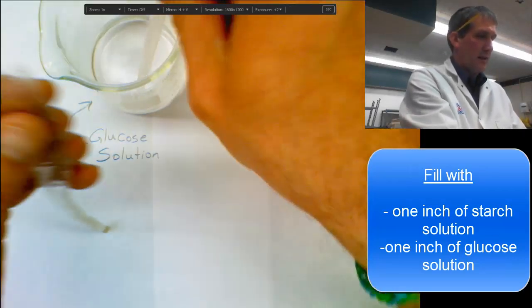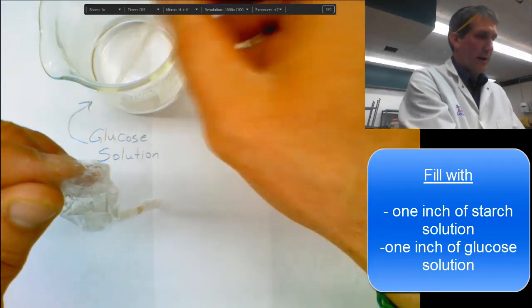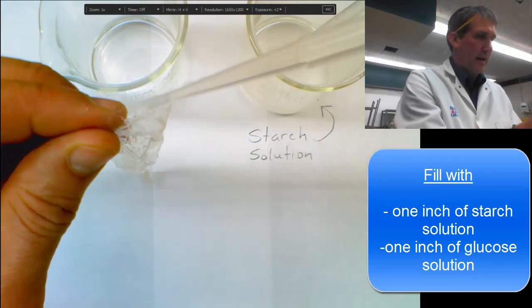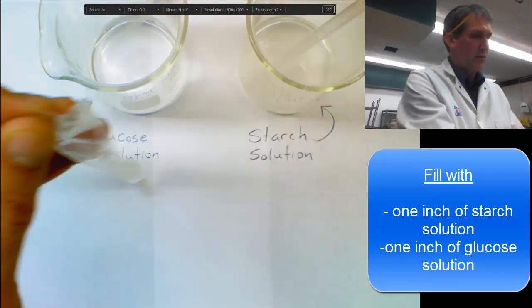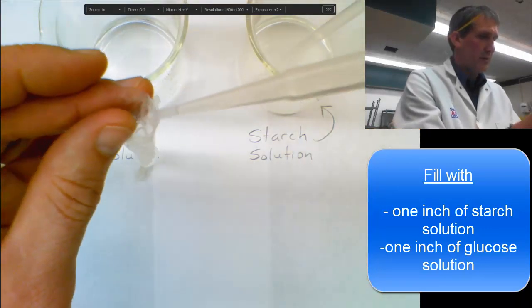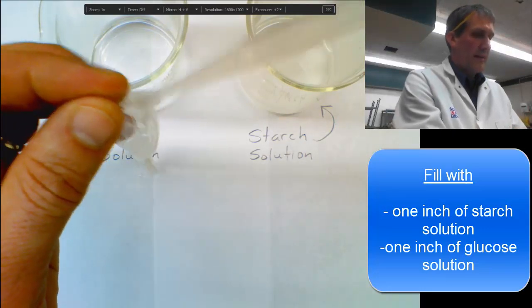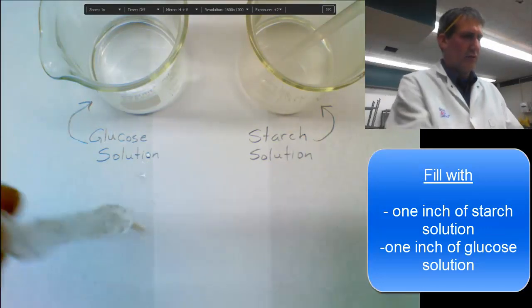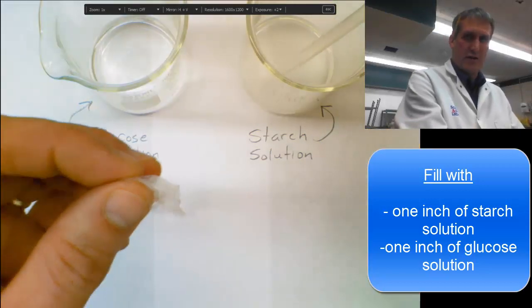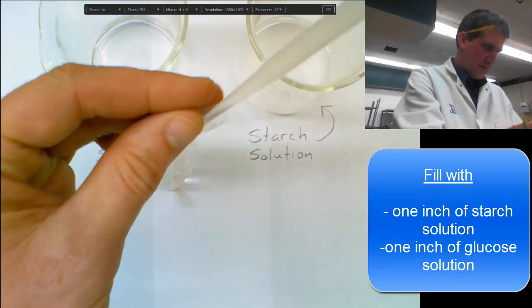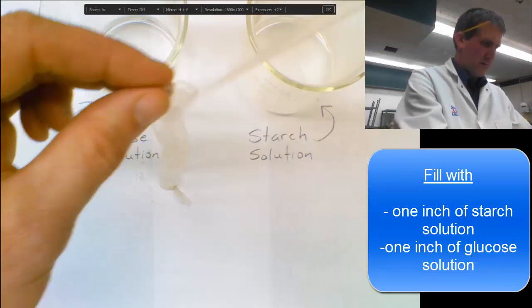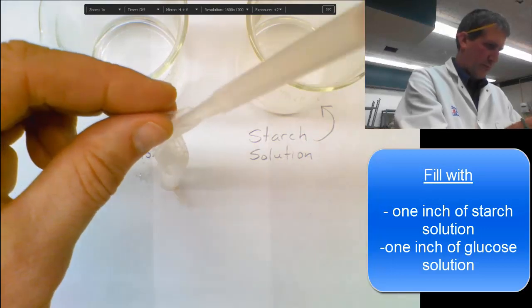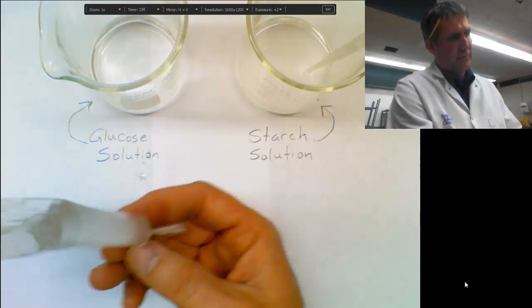So I'm going to go ahead and start with the glucose solution. So I have it open here. You can use a dropper. It goes pretty quick. There's one. You might have to do three or four depending. But you just want to get it so I'll put one more. It will be three complete droppers. And that's actually a good amount. You see how I have about an inch of glucose solution. Now I'm going to add my starch solution. One, two, three full pipettes. And that's actually plenty, a big enough cell.